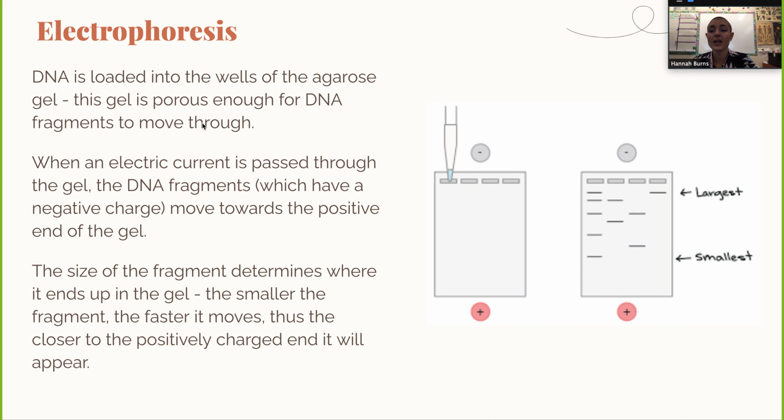And then finally, for gel electrophoresis, we load the DNA into the wells at the top of the gel. And this gel is known as agarose gel. It is porous, kind of like a sponge, and that allows the DNA fragments to move, but they have to move through in a specific way, so that's why shorter fragments move a lot faster than longer fragments. And so once you have the DNA loaded into each of the wells, then you'll turn on an electrical current because DNA is negatively charged. It's going to move down towards the positive end of the current that we're running through our gel.